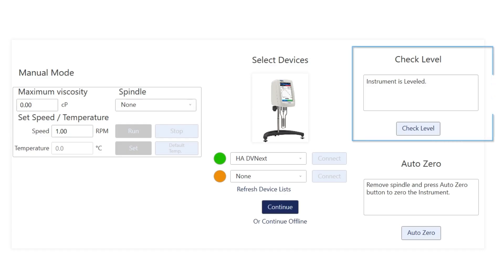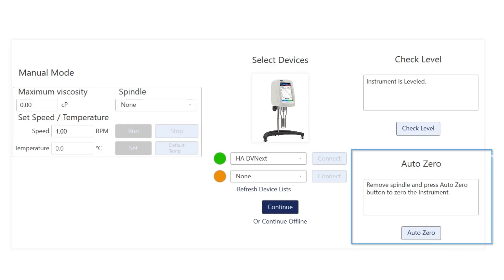Here you can see the Check Level option. The instrument is already leveled. To check the AutoZero, we can perform the AutoZero function now.